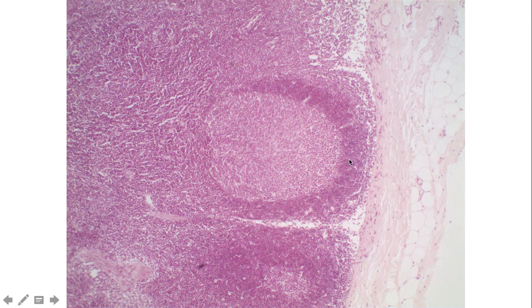And so really what's happening here is this lymph fluid is being forced to move through these small little cortical sinuses. And as it weaves its way through this maze of sinuses, it's going to be coming in contact with potentially millions and millions of B lymphocytes. And as these sinuses move through the cortex, they're referred to as the cortical sinuses. And now as they move through the medulla, they are called the medullary sinuses.